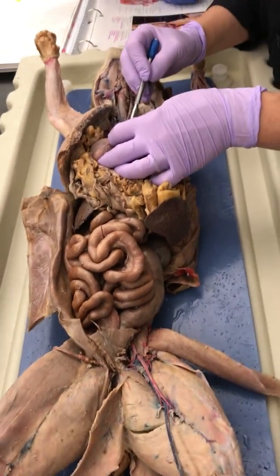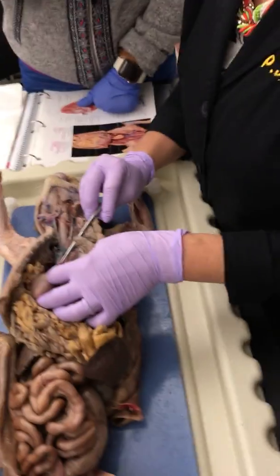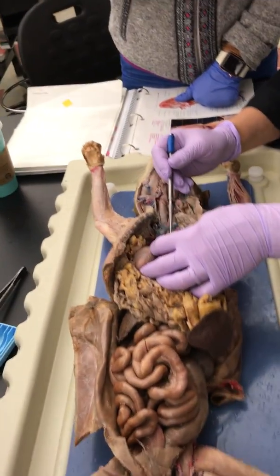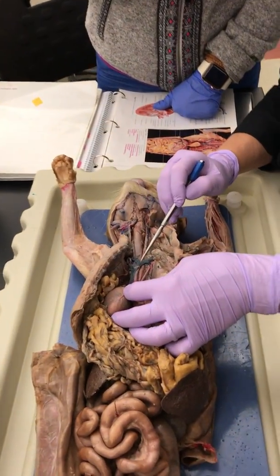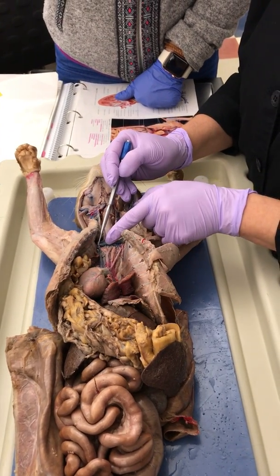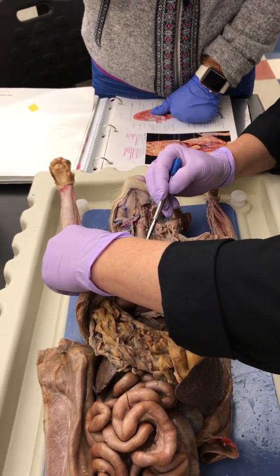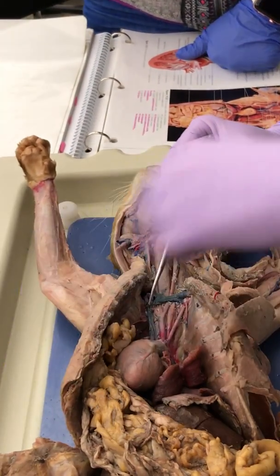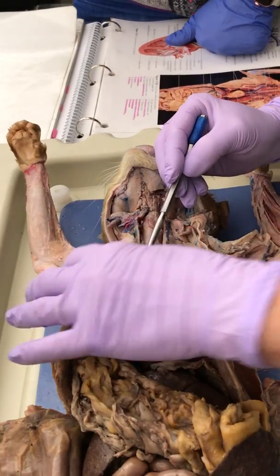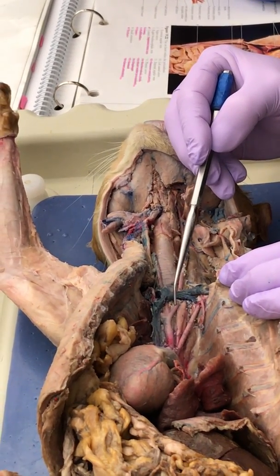Your aortic arch and your descending aorta. Here's your brachiocephalic artery and your left subclavian, because that's how it works on a cat. And then we come up here and we can see the brachiocephalic branching. So we have the right subclavian there, the right carotid and the left carotid.